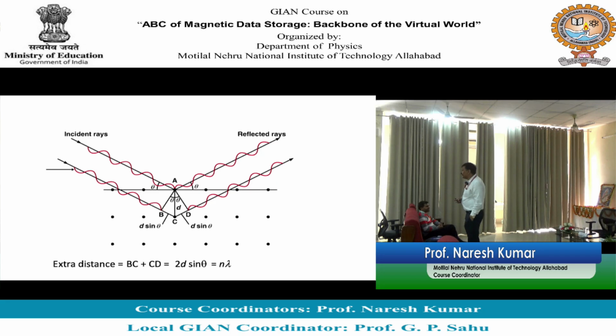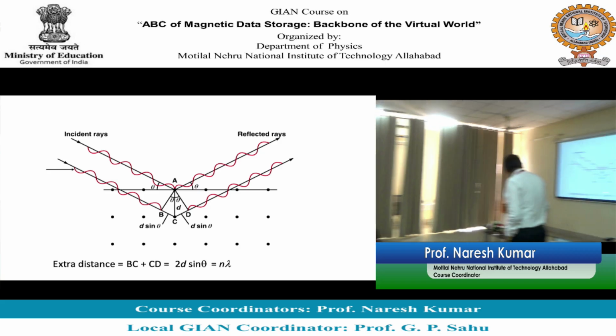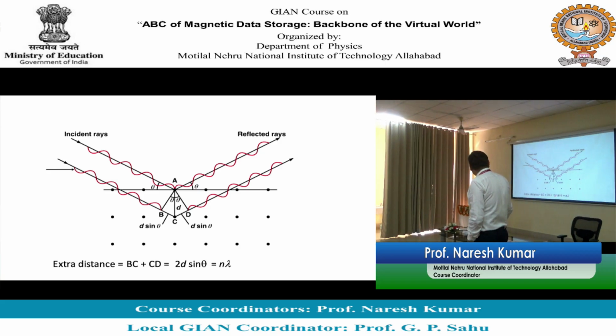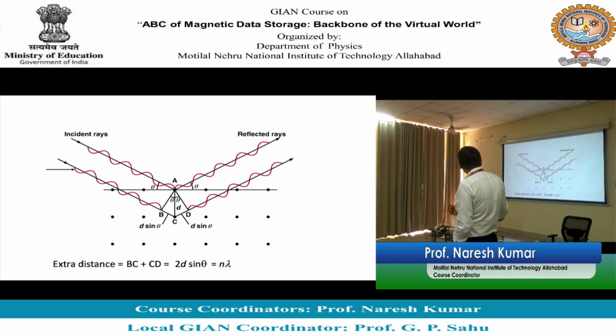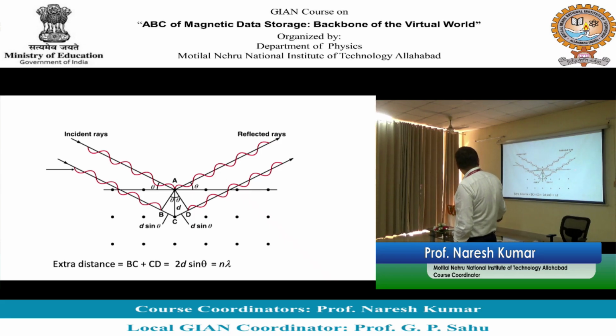अच्छा समझिए जरा, what is this 2d sin theta? It depends on d and theta, right? So आपने क्या किया, यहां से डिटेक्टर उठाना शुरू किया. You started increasing angle of theta, है ना, from here. So what had happened? 2 is a number, d is a number, and sin theta is a number. If you take multiplication of 3, you will get some number.